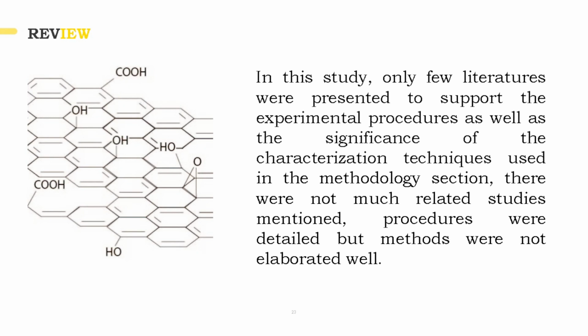Some of the assumptions made were on optical absorption of graphene oxides, but researchers infer that the optical absorption is dominated by the pi to pi* plasmon peak near 230 nanometers. It was stated from UV spectroscopic studies that the pi to pi* plasmon peak depends on two kinds of conjugative effect. One is related to nanometer scale sp2 clusters, and the other arises from linking chromophore units such as carbon to carbon or carbon to oxygen bonds. Though this study cited only a few related literatures, there was still no absurdity mentioned in the paper.